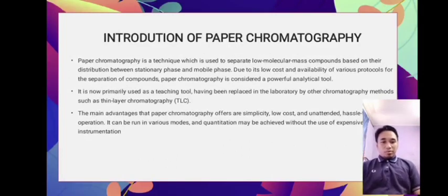For the introduction of paper chromatography, it is a technique which is used to separate low molecular mass compound based on their distribution between stationary phase and mobile phase. Due to its low cost and availability of various protocols for the separation of compound, paper chromatography is considered a powerful analytical tool. It is now primarily used as a teaching tool, having been replaced in the laboratory by other chromatography methods such as thin layer chromatography (TLC).